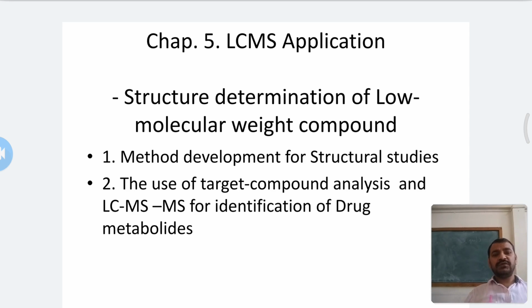First we discuss method development for structural study, and then the second point, the use of target compound analysis and LCMS MS for identification of drug metabolites.